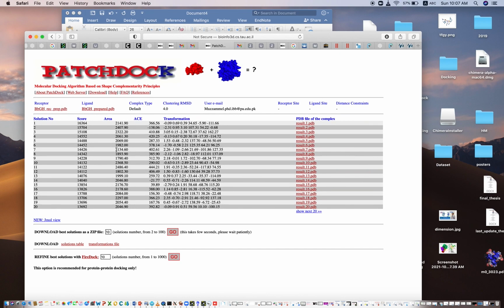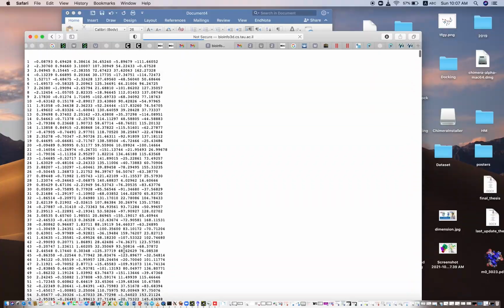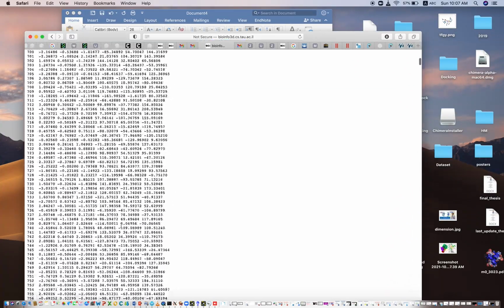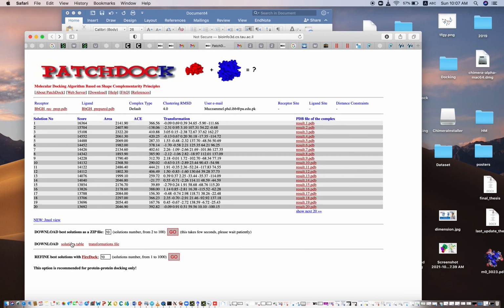If you want to download the 10 complexes, you can click on this go, or you can click the solution table and transformation file. These will all be downloaded. If you click the transformation file, it will show this transformation file. You can copy it.